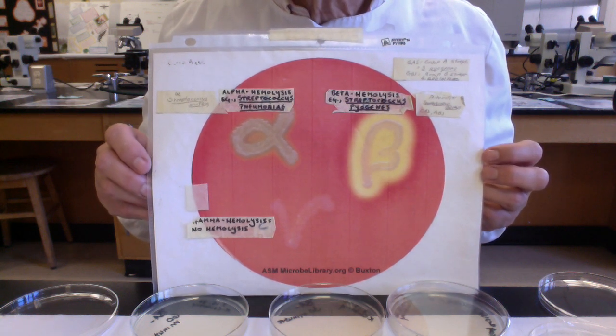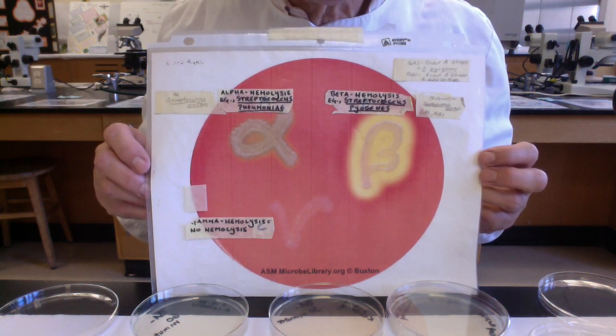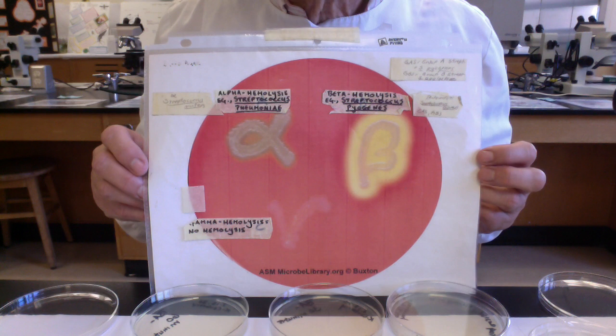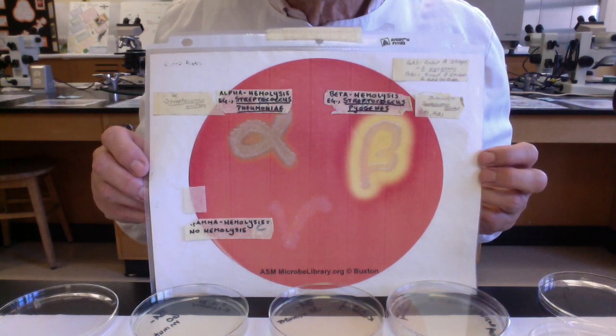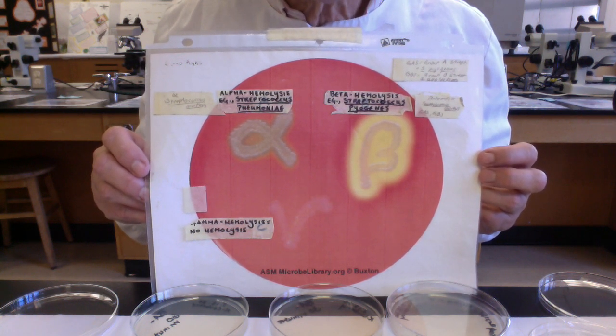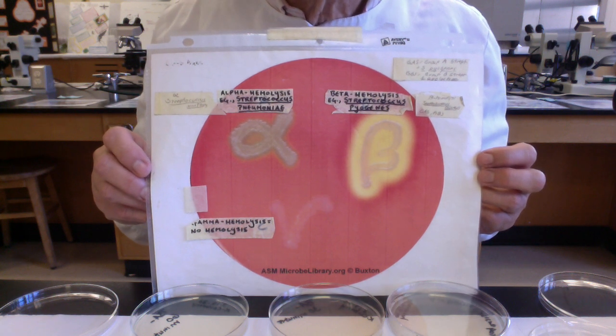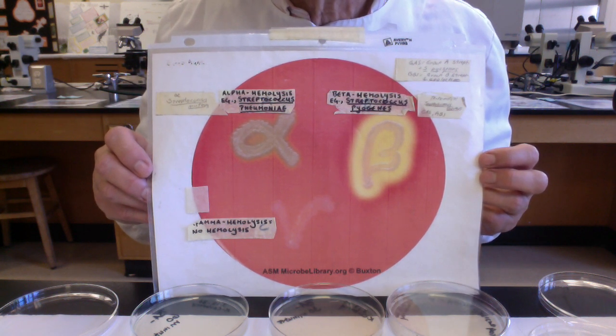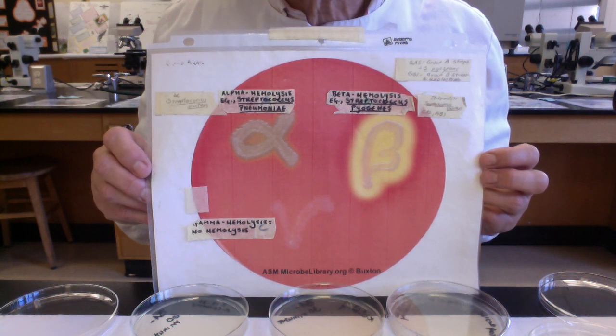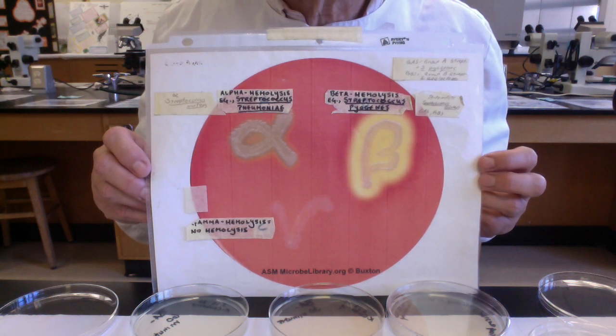Two members of the genus Streptococcus are also beta hemolytic. Streptococcus pyogenes, which causes strep throat, the sore throat. If we did a throat swab and transferred it to blood agar, if Streptococcus pyogenes was present, it would cause beta hemolysis.